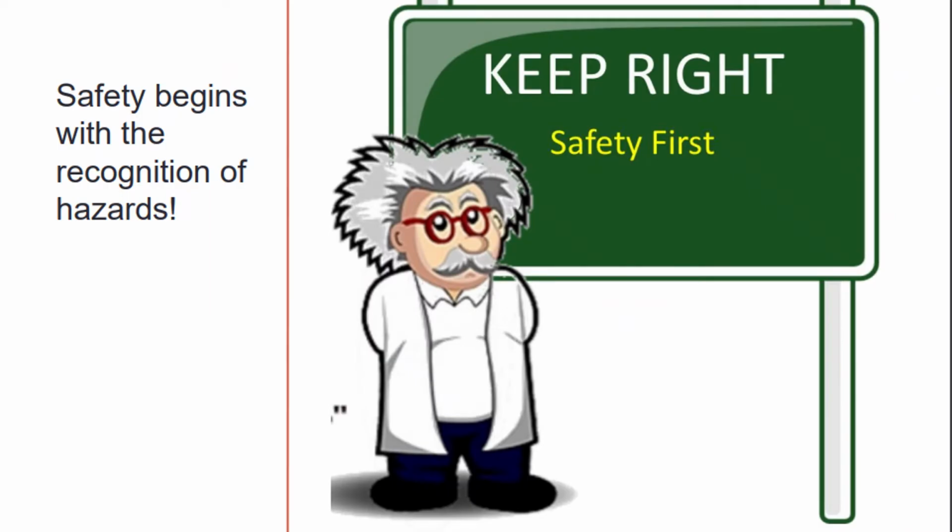Laboratory safety necessitates the effective control of all hazards that exist in the clinical laboratory at any given time. That is why safety begins with the recognition of hazards and is achieved through the application of common sense, a safety focused attitude, good personal behavior, good housekeeping in all laboratory work and storage areas, and above all, the continual practice of good laboratory technique. In most cases, class, accidents can be traced directly to two primary causes.